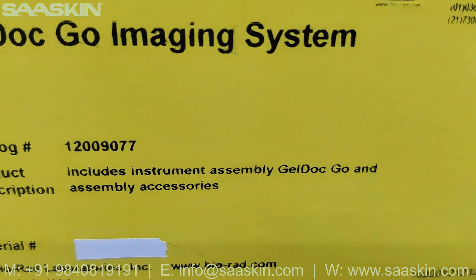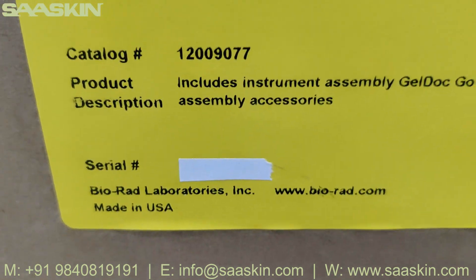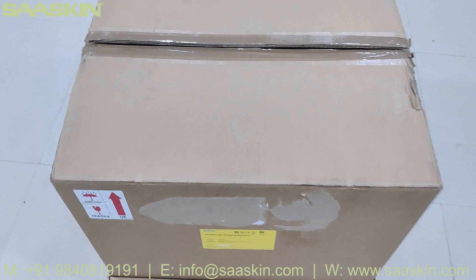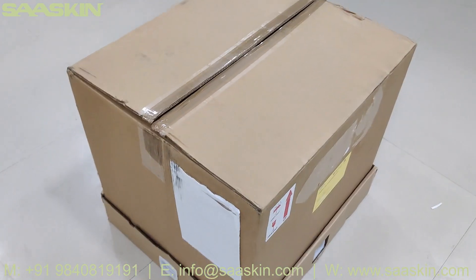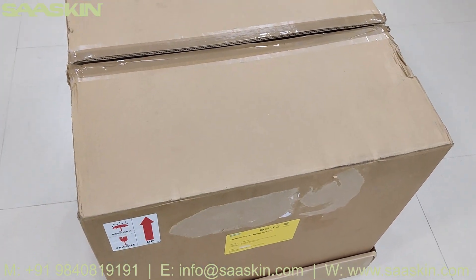The box includes the instrument assembly — GelDoc Go — and also the assembly accessories that you need. It is made in the US. Basically, this GelDoc system is used for your analysis of nucleic acid and protein gels. It gives very high resolution details and will be helpful for better analysis.